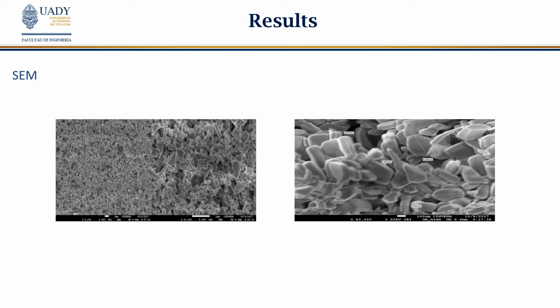The scanning electron microscope images for the zinc oxide thin films showed the presence of crystals of different sizes arranged in a mesoporous form. The smaller particles were those suspended in the colloid and shown in the Z-sizer analysis results, while the larger particles were of the precipitate, with estimated particle size of up to 450 nanometers.